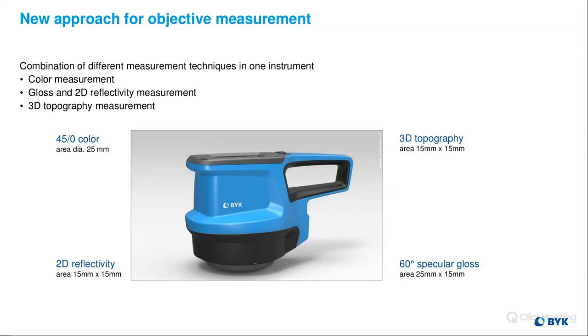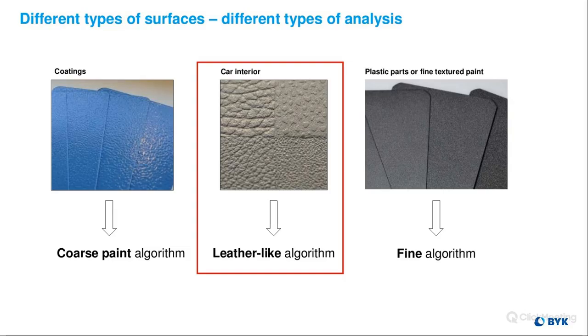With that, we spoke over the internal geometries and the measurement principles behind it. Now we'll dive into the actual mathematical calculations and algorithms, and what the actual values are that you'll get on your material and how those are useful.